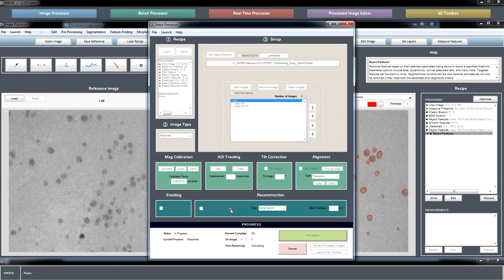It seems to be running okay. I do know, I think it was in beta 1 or 2, that you weren't able to run a batch with a crop step in there. Were you running it as part of a 3D data stack?